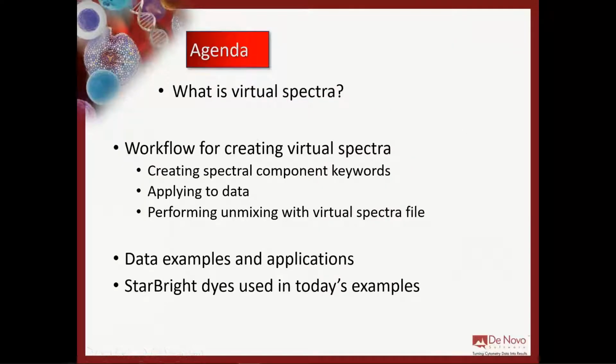So on the agenda today is what is virtual spectra. We're going to spend just a moment or two discussing that. Today's webinar is meant to be more practical, of how to actually use some data you already have to create virtual spectra. So we're going to be following on and looking at the workflows for creating virtual spectra from any of your overdetermined instruments and data sets and how we do that.